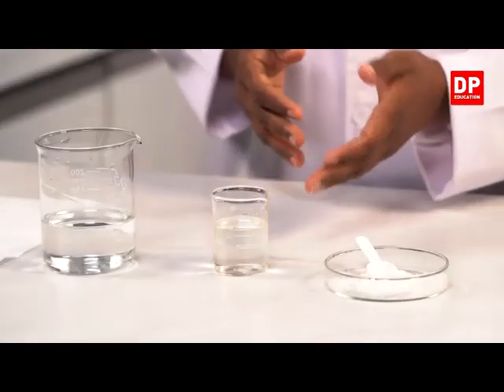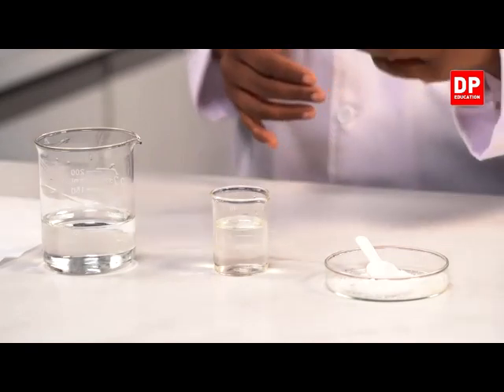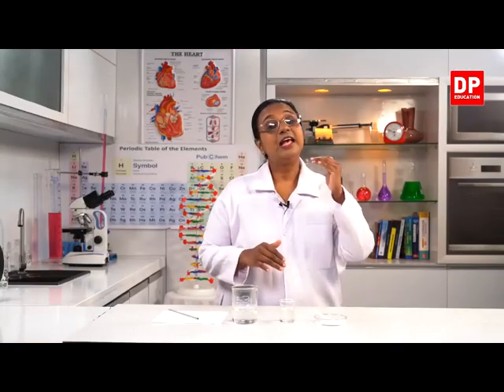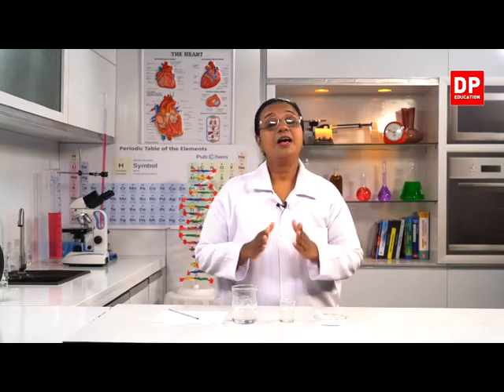Okay, students. Now can you all see the solution clearly? You can see the transparency is uniform throughout the solution. It's a clear, transparent solution, and you have to understand the composition is uniform because its transparency is uniform throughout the mixture. Such mixtures are known as homogeneous mixtures.